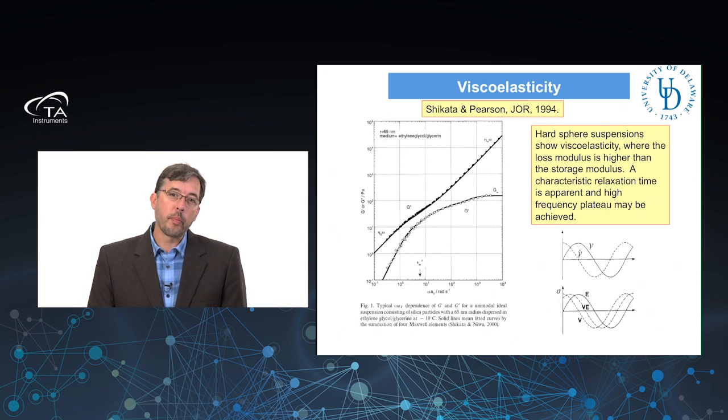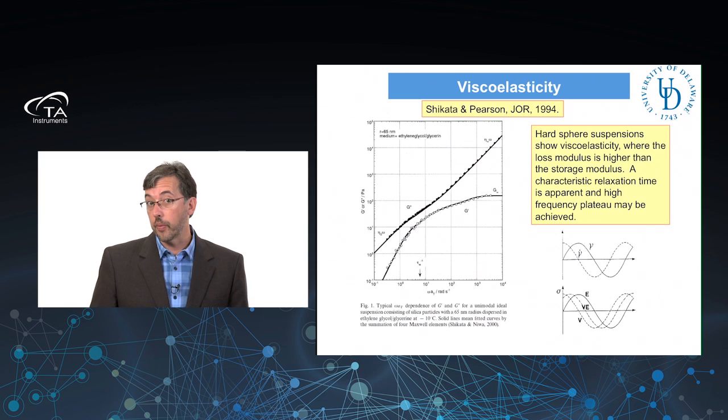What we do is we separate out the stress response, which is shown in the lower right graph, as stress versus time. And you can see we could separate it into a part that is in phase with the strain rate, and that's known as the viscous modulus, and a part that's in phase with the strain itself, and that's known as the elastic modulus. Think of a spring-like behavior.